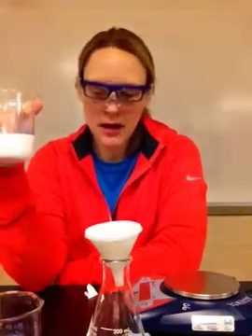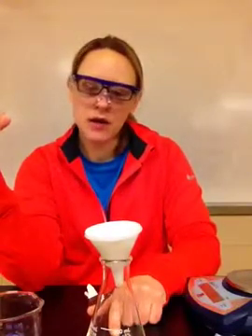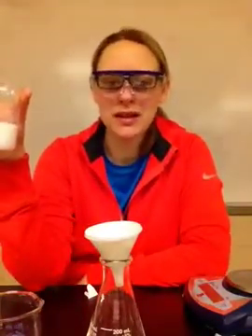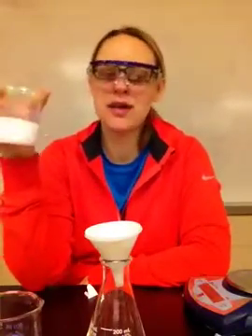Okay. Some other things to look at, and you might want to write this in your procedures: make sure that there's not white cloudiness in the bottom of your Erlenmeyer flask. Okay? If there is, you might want to refilter it. You also want to make sure that everything is really, really clean, because you might want to clean it again, because who knows who cleaned it before, their soap, all that kind of stuff, because it might mess up your data.